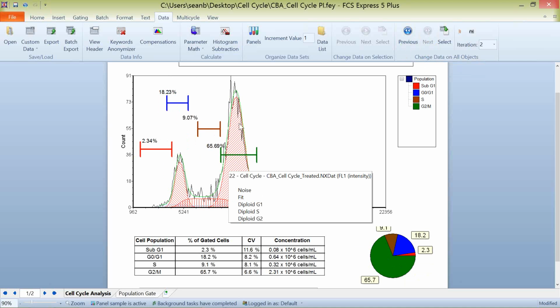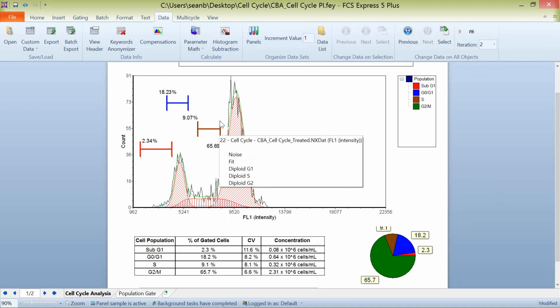Yeah, so if we came in and there was some sort of inhibitor, and we actually lost all of G1, and everything banked up into S phase and G2, or vice versa, if it all banked up in G1, there are some difficulties in modeling that for the average user. When we want to model this data and people want to take this to the next level of using the modeling tools, it's something we can work with that customer on.